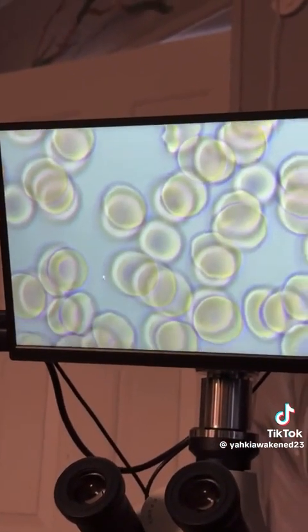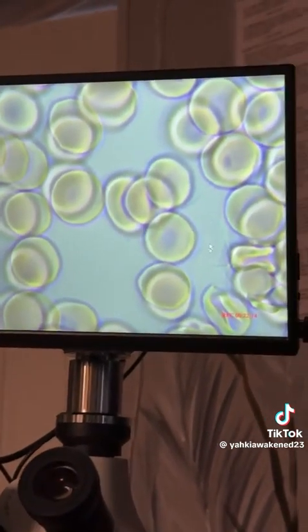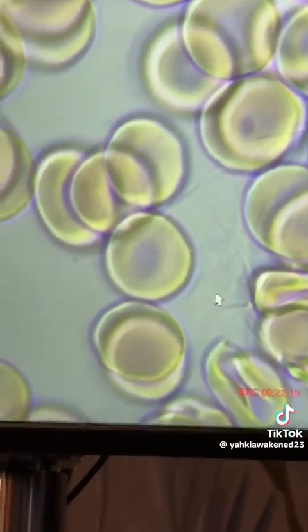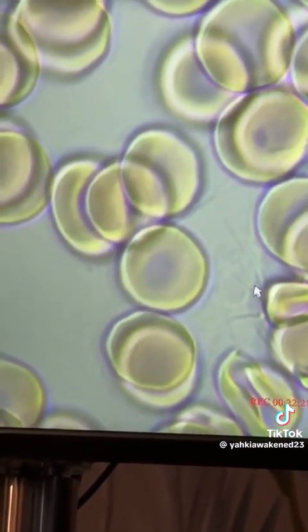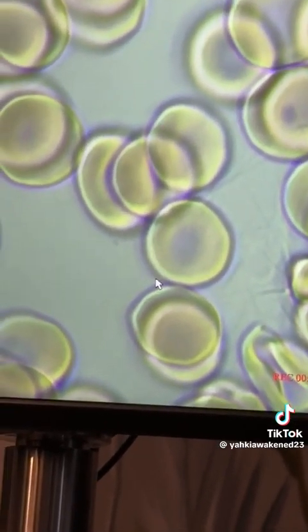But what I want to show y'all is this. Where is it at? All right. We lost it, but we're going to find some more. Right here, this is called fibrin. If y'all can see these little straight lines within the plasma, it's called fibrin. Fibrin in the system is due to fibrin protein, or what you will call immunoglobulin, and this causes erythrocyte aggregation. And this is when the blood begins to clog or clot within inside the system. This can lead to heart attack. This can lead to stroke, thrombosis, and everything.